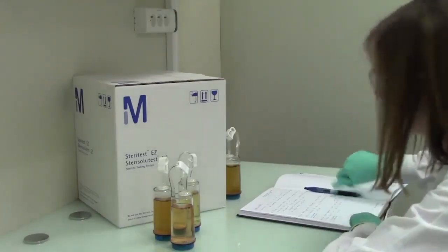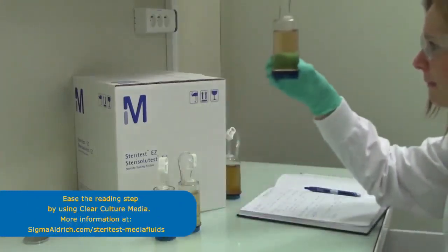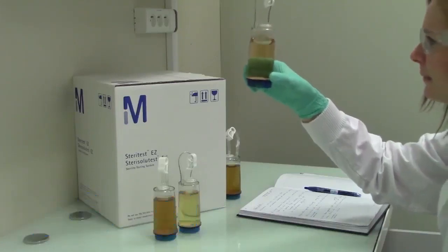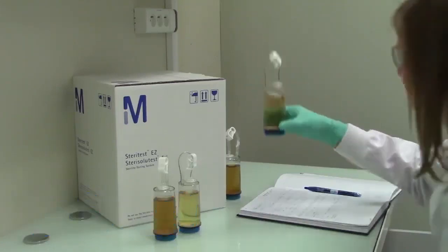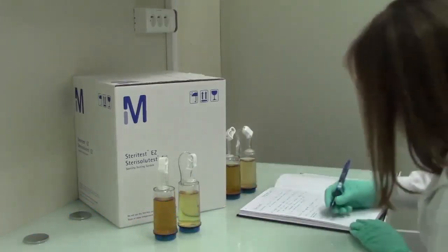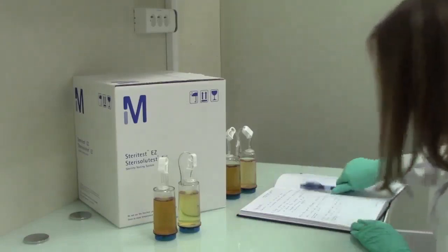If no evidence of microbial growth is found, the product to be examined complies with the test of sterility. If evidence of microbial growth is found, the product to be examined does not comply with the test of sterility unless it can be clearly demonstrated that the test was invalid for causes unrelated to the product to be examined.